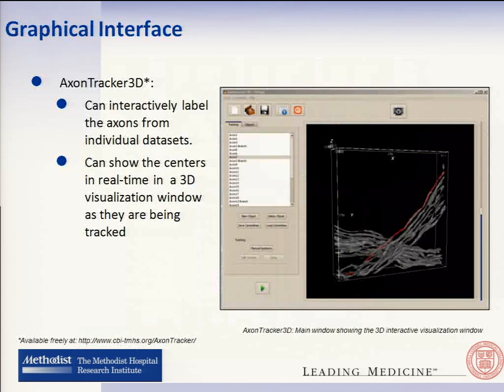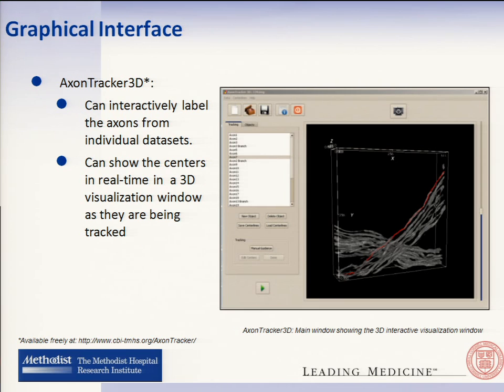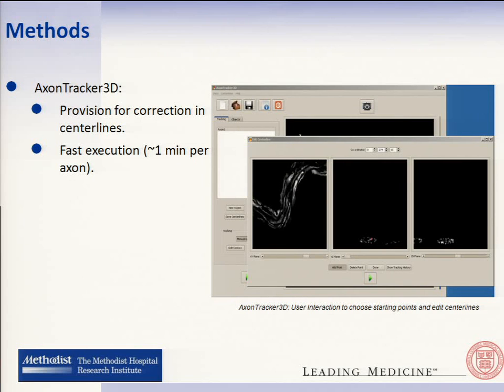Here you can see the interface for Axon Tracker 3D. There is a render window where as soon as the user loads the data, it is shown in 3D, and you can see all the axons have been traced. The user can actually visualize the tracking process as it is going on, and if there is any problem, can stop it at any point and correct it. This can also be visualized using cross-sectional views, where the user can correct, delete, add, or verify the tracking process, and can play back the whole tracking process to check if it is correct.